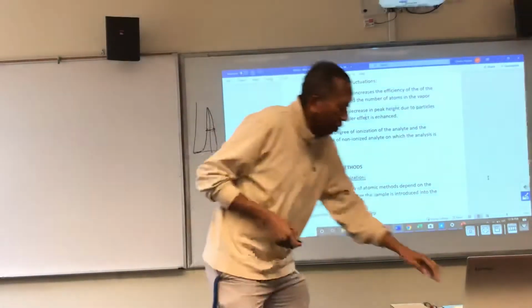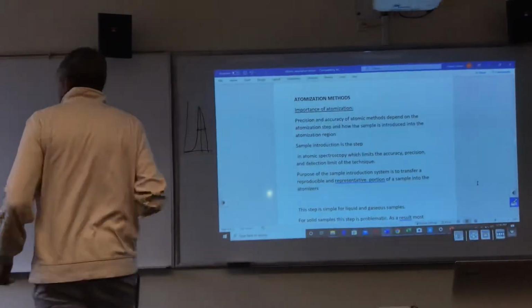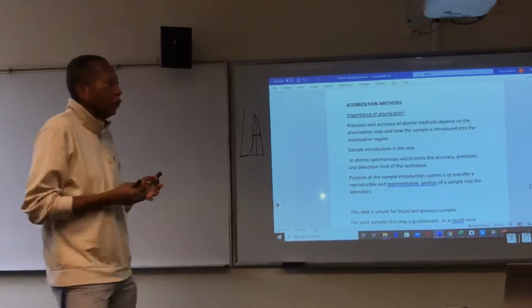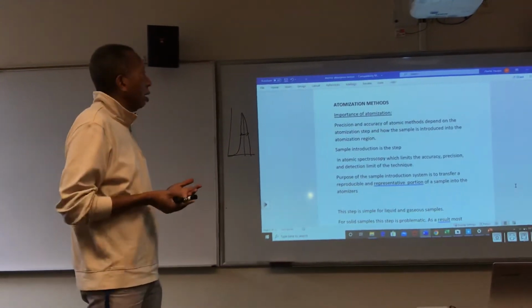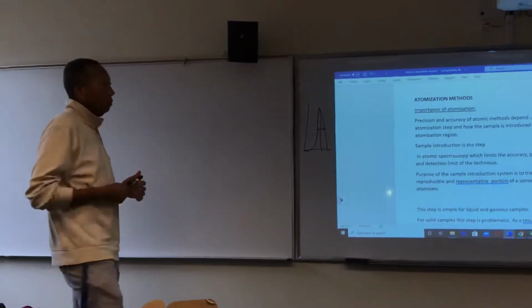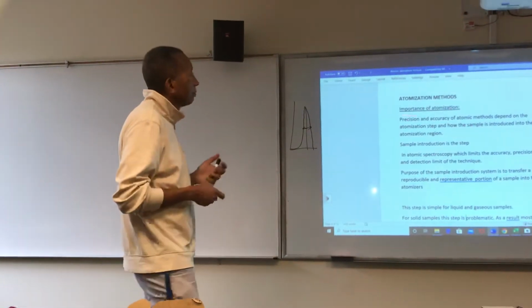Let's look at atomization methods, okay? When we talk about atomization methods, something should come into your mind. That is, how are we going to convert our sample from whatever form it's in, whether it's a solid or a liquid, how are we going to get it into atoms, right? Because we're doing atomic spectroscopy. When we did molecular spectroscopy, we didn't have to worry about getting it into molecules, right? We just put our sample in solution in molecular form, and we're fine, right?